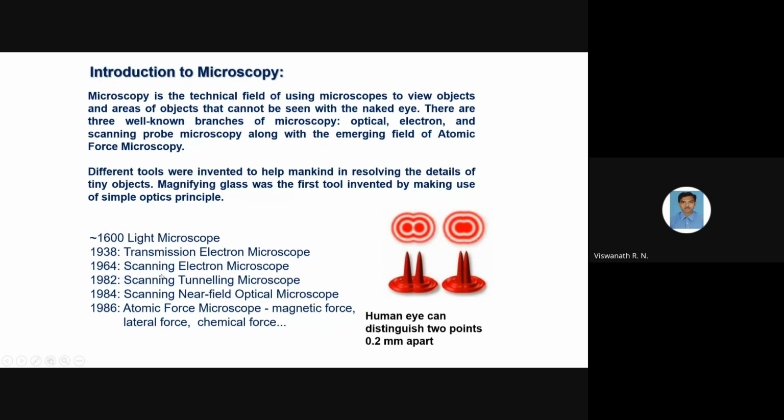Objects of smaller dimensions, for example the electron, have a dual character. It can behave as a wave as well as a particle. If you assume it is a wave, then it will tunnel through the barrier. If you assume it is a particle, it cannot tunnel and will bounce back like a normal object hitting a wall. That is why the tunneling concept is important in the tunneling microscope.